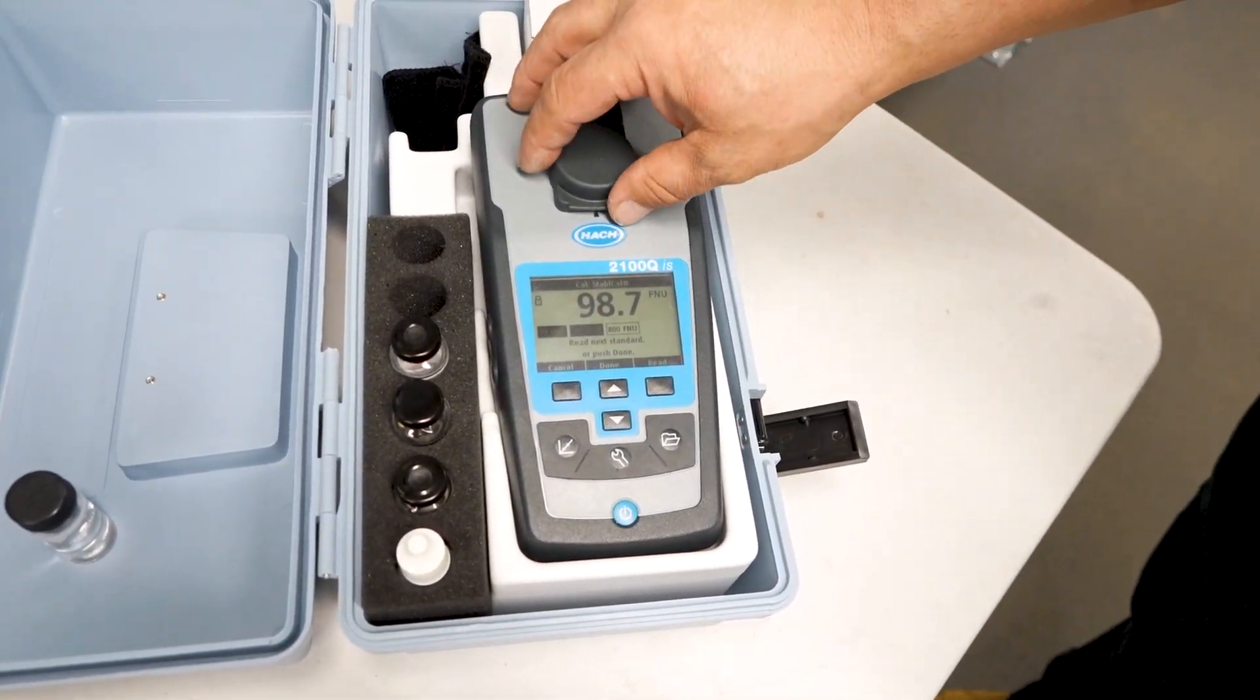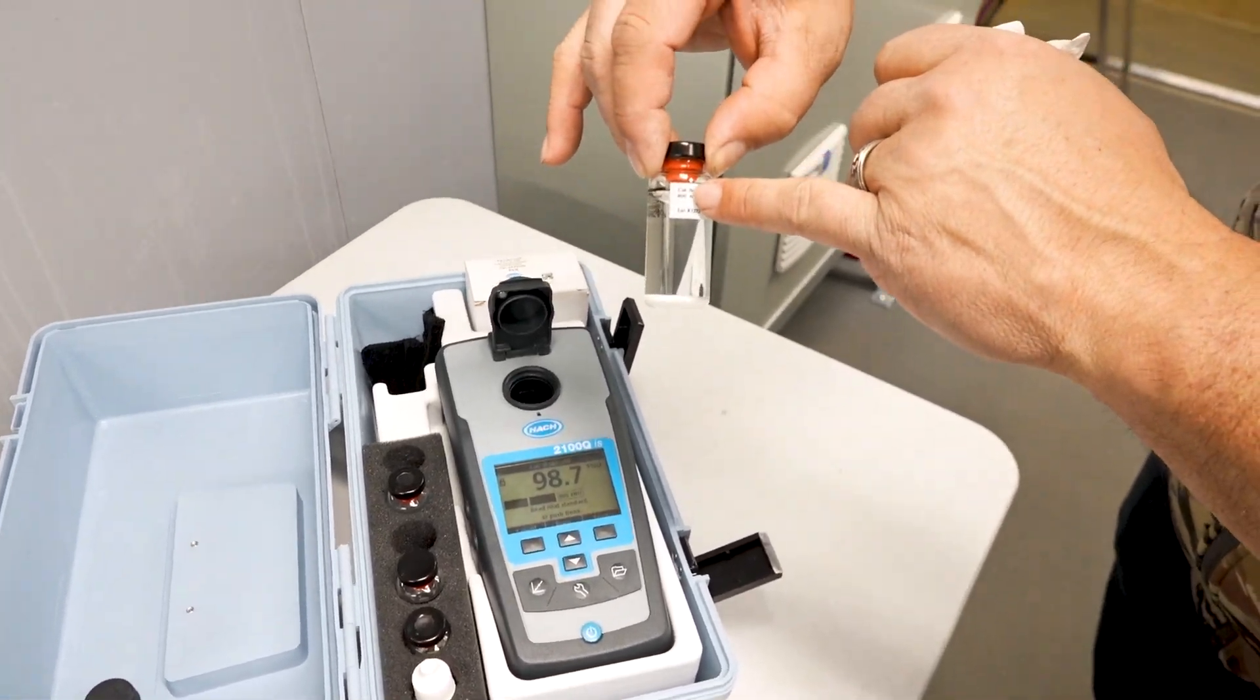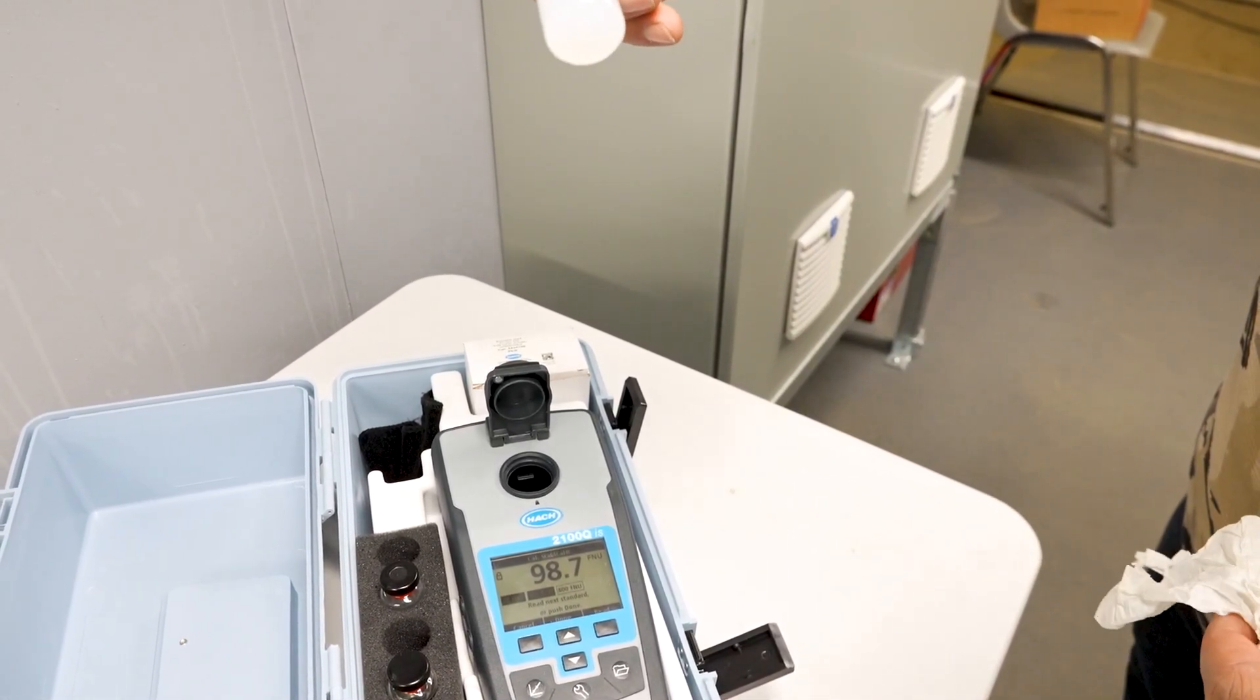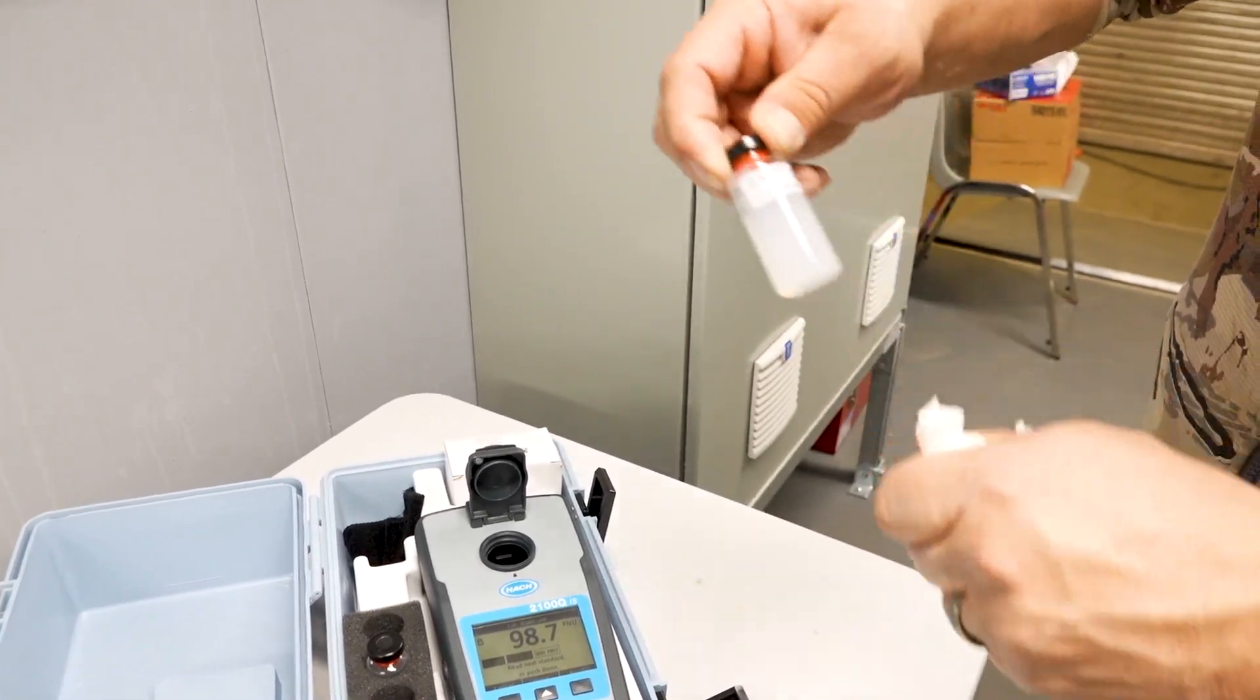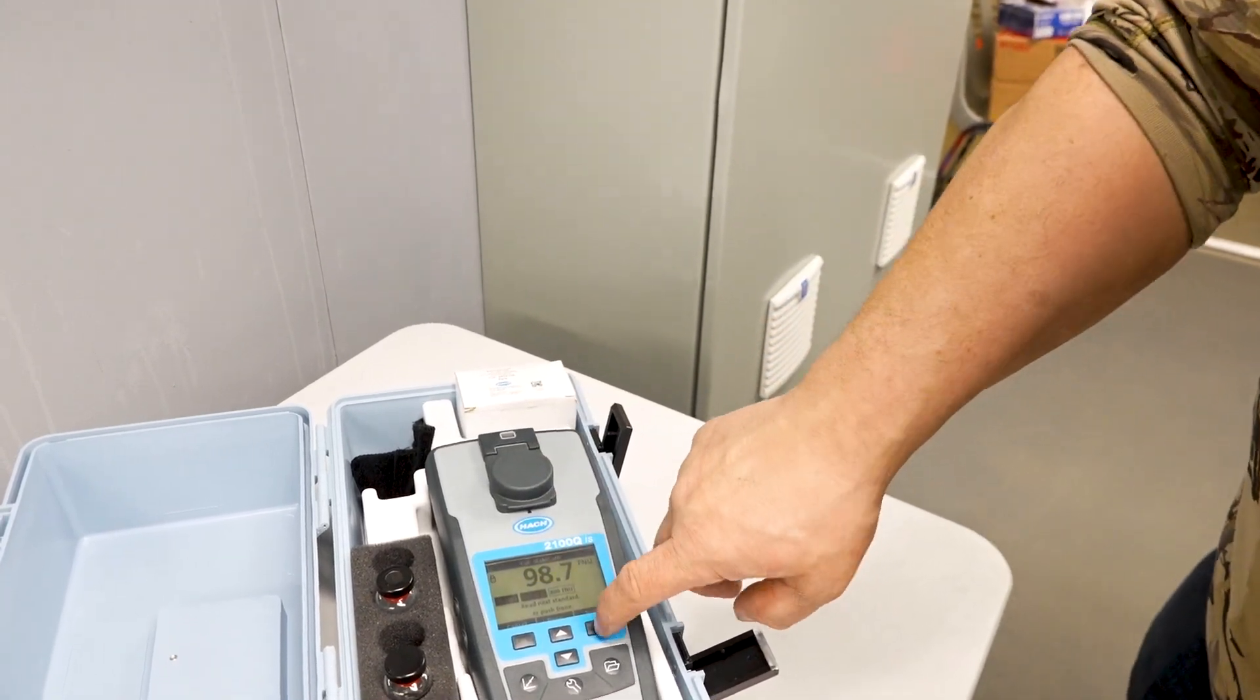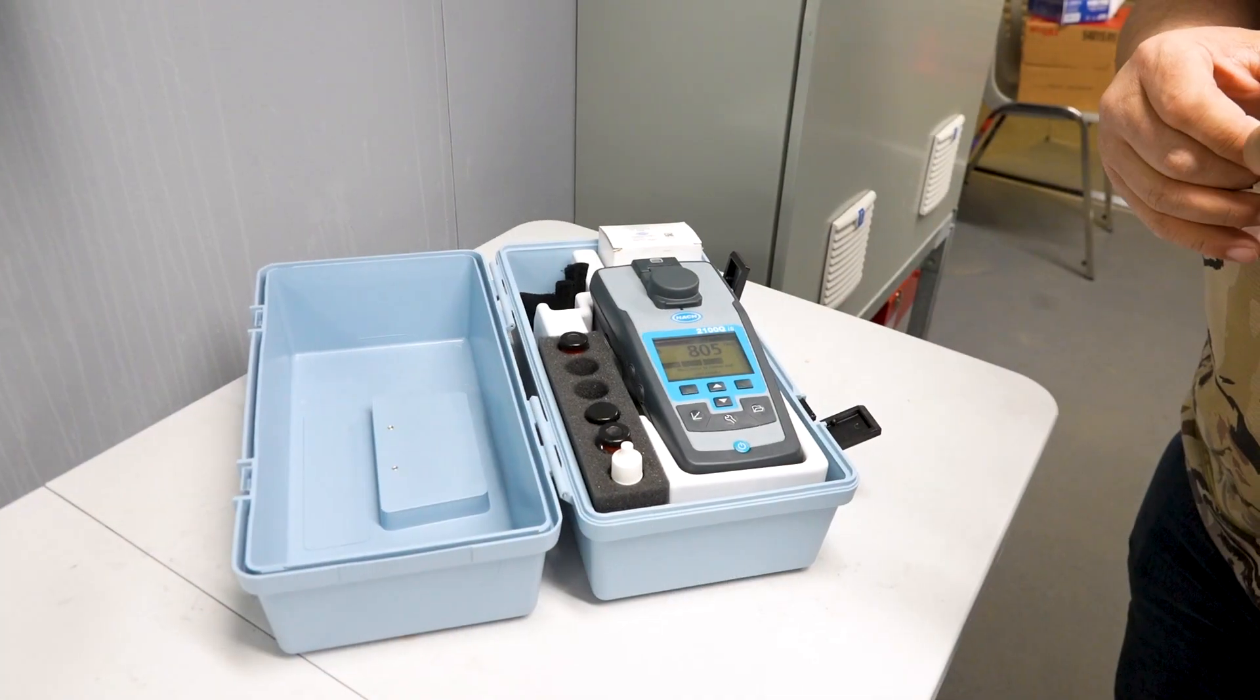Once the 100 NTU sample is done, you remove it, and then we grab the 800 one, it'll be labeled again 800 NTU. This one you've got to mix again. This one's going to be a lot thicker, a lot higher NTU on it, 800 NTU. Once you've got it mixed in, polish it up, and arrow to arrow again, and read. And after this step, it'll tell you if your unit has been calibrated correctly or not.